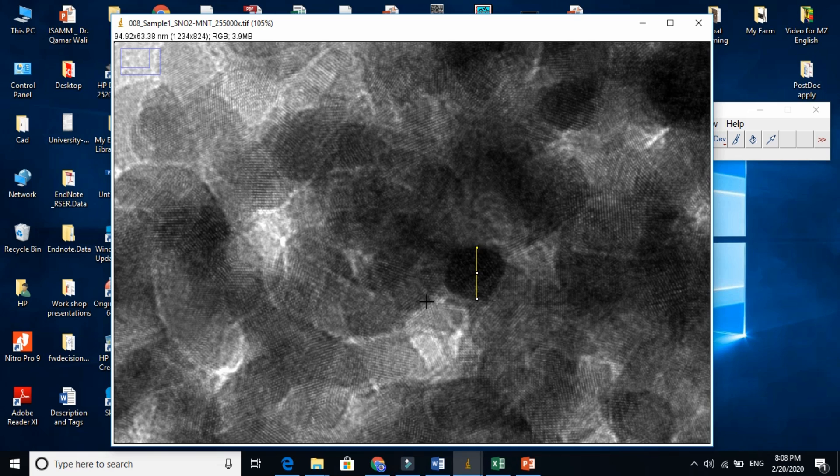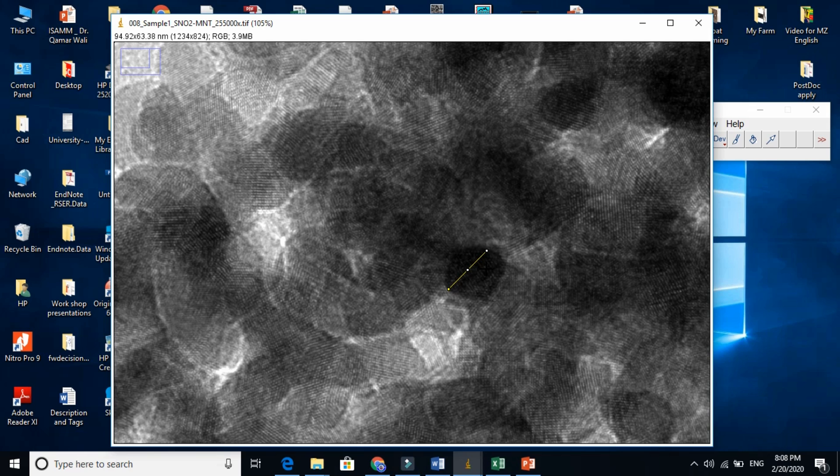And now, if you want to find the exact dimension of this grain, this is one way.